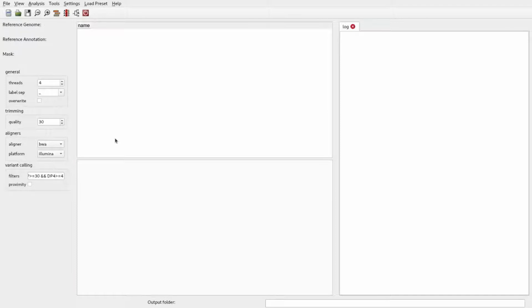So this is done for a subset of species that have very closely related sets of strains that makes this analysis useful, such as Mycobacterium tuberculosis and a few other species. And this program is usually written as a command line tool, but this is a GUI to make the process a little bit easier and to add a few extra bits of analysis that you can do.